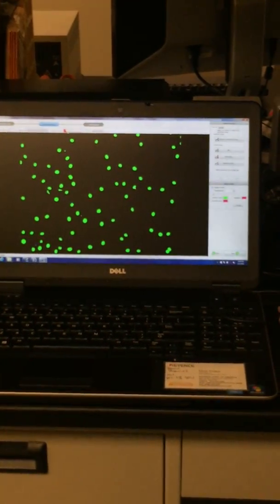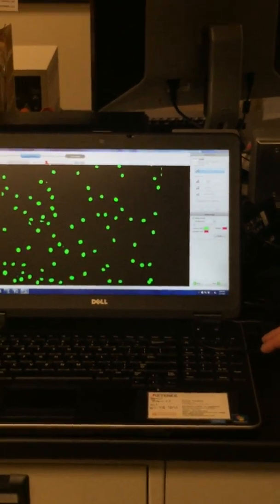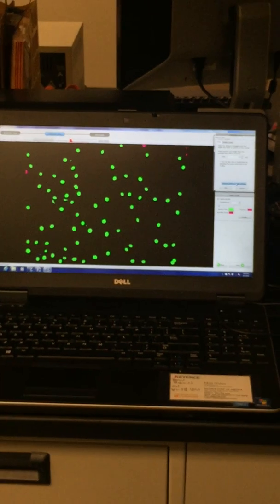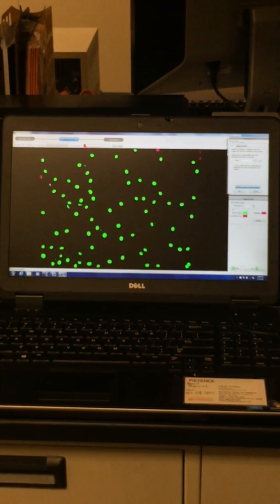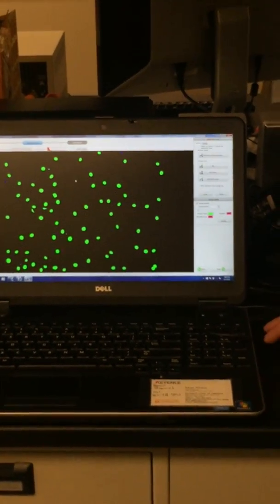Because here's where you do all of your adjustments. One thing I always do is remove unwanted areas. This button right here, remove areas at the edge of screen, is super useful because, for this one right here, it's half in, half out of the field of view. Your area is going to be off, so your data is going to be off. So it just gets rid of that to begin with.